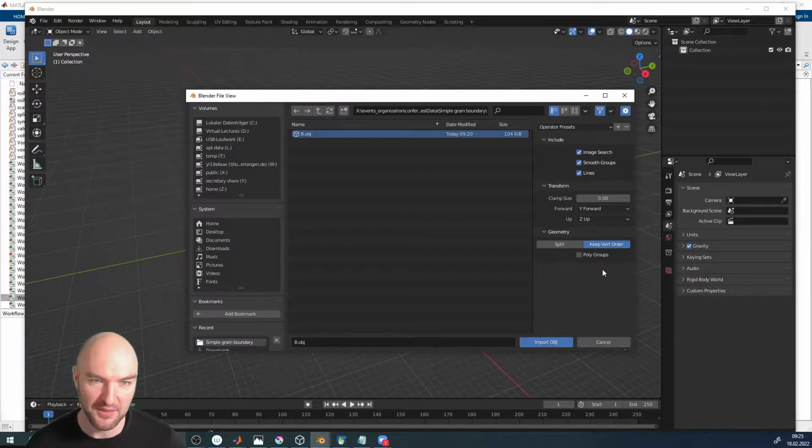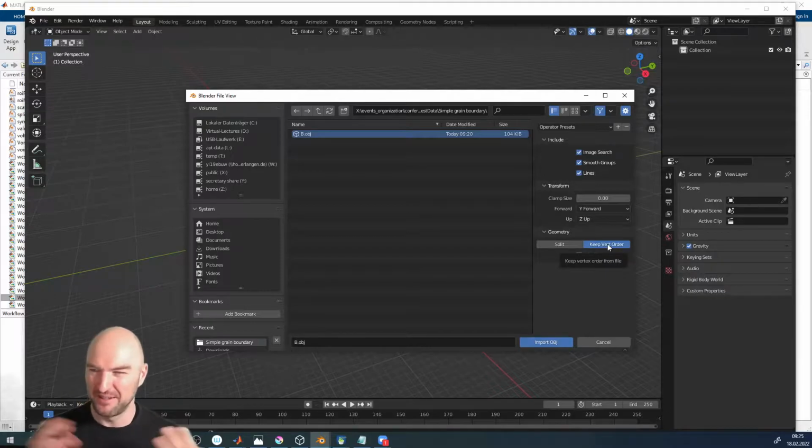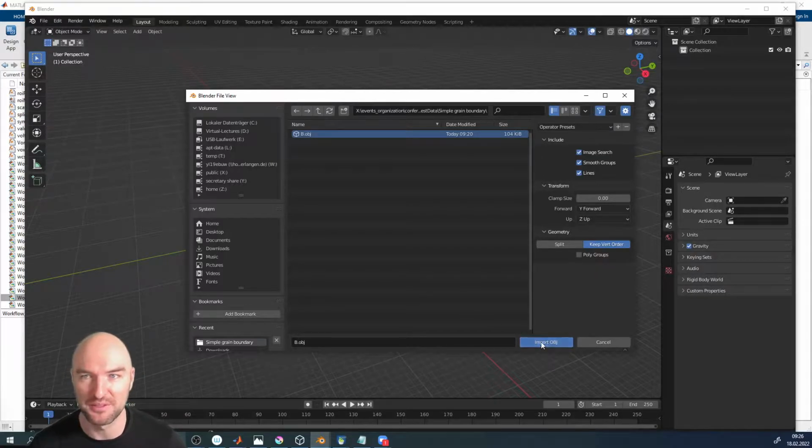Otherwise, traditionally it would drop any vertex that doesn't belong to a face or a line, some kind of object, because in 3D animation data sets you can have stray vertices that don't belong to an object, and it would just clean all of this out. In our case, all of our vertices are stray vertices, of course, and we want to preserve them.